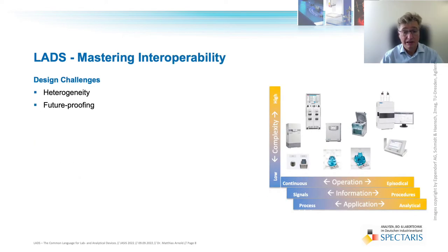But how can LADS fulfill its promise of interoperable connectivity? We are facing several challenges. Heterogeneity: there are several dimensions of heterogeneity in terms of device types, device vendors, device functionality, complexity, mode of operation, applications, and so on. And future-proofing: how to specify a protocol which is suitable for future device types and functionality.